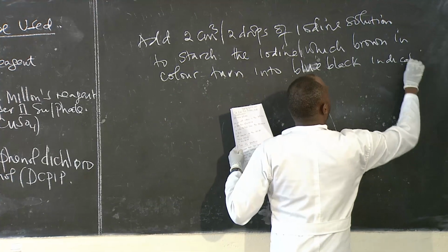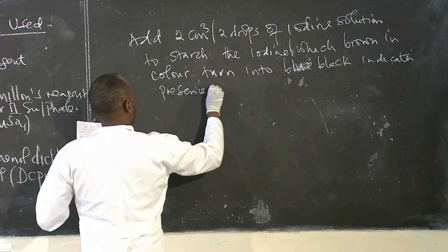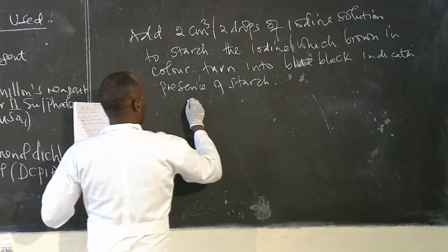Indicates presence of starch. You can say this is positive.